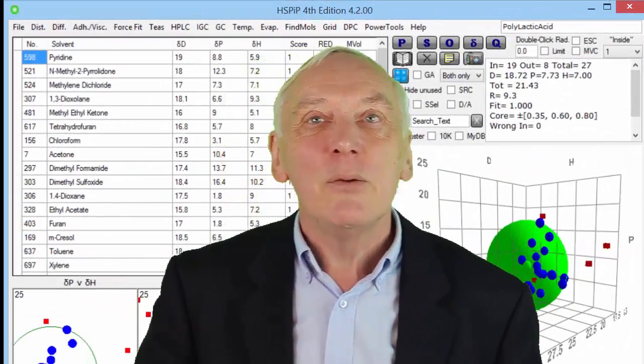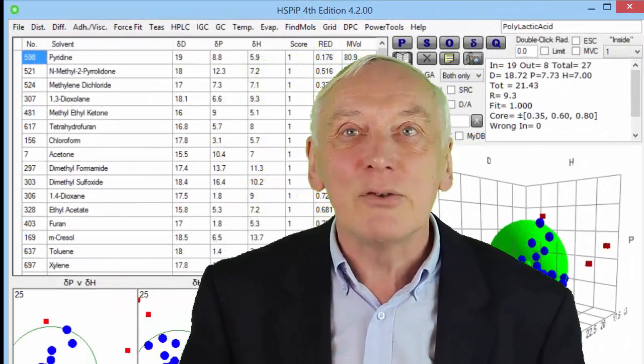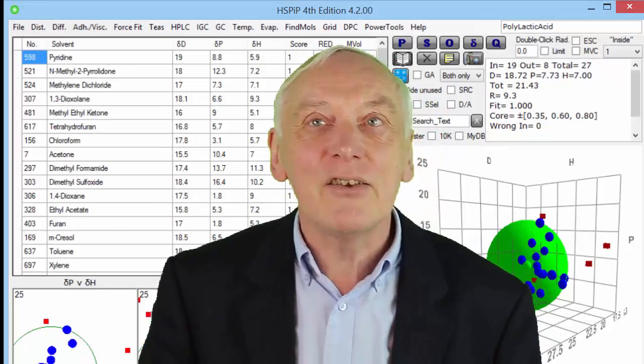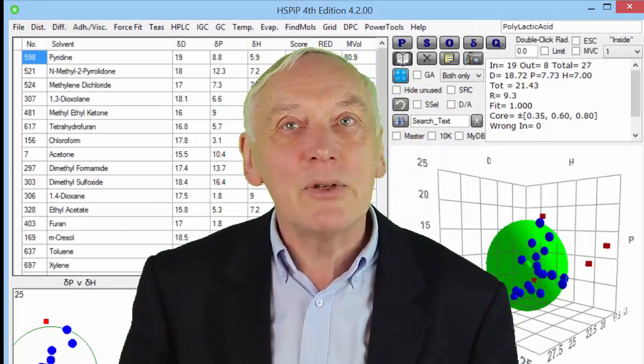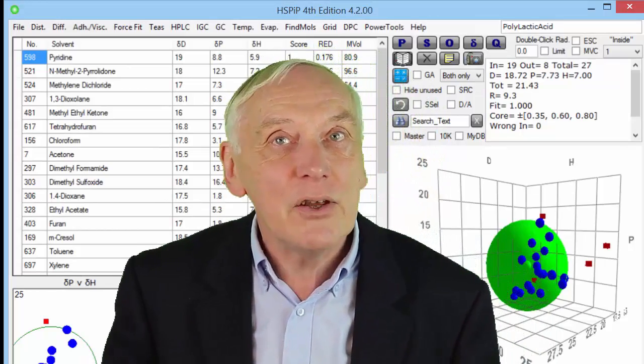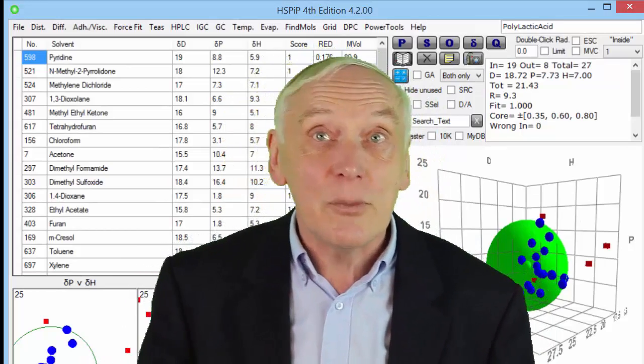In this clip we will look at how to measure the Hansen solubility parameters of an unknown such as a polymer.